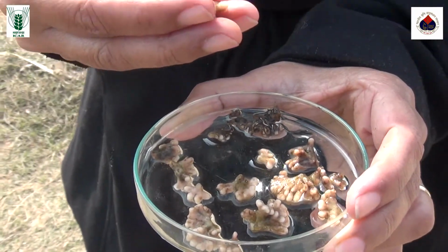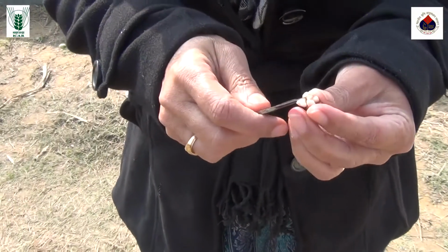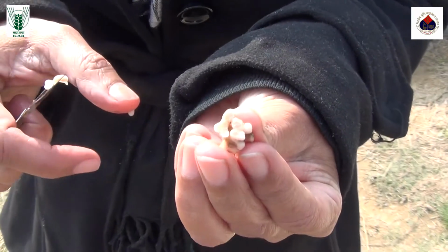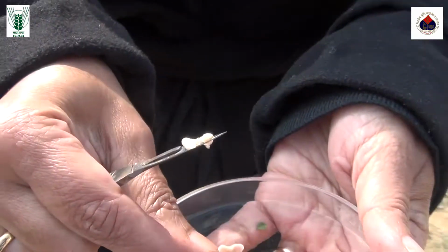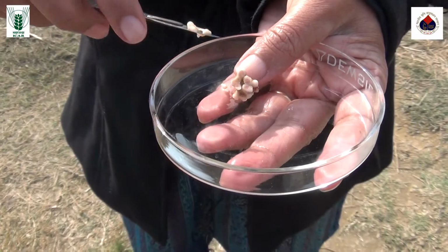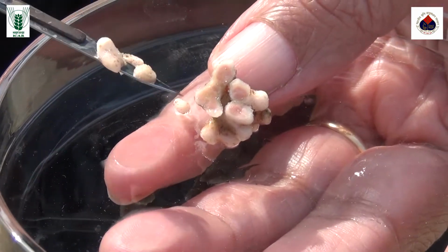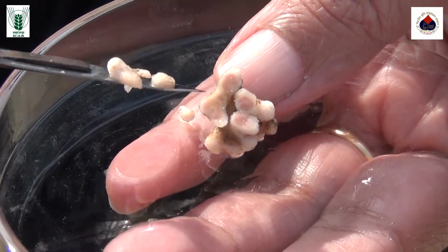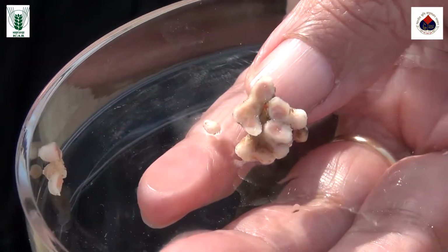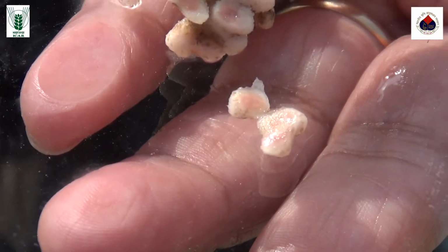I'll either squeeze it, or we have a scalpel, so I can cut it. Can you see this inside circular pinkish color? That is the leghemoglobin there. And when you cut every single nodule and find this reddish central part, that means that nodule is active and is an effective nodule which converts nitrogen to ammonia. You can see here also, which I have cut here. See this pink central red color.